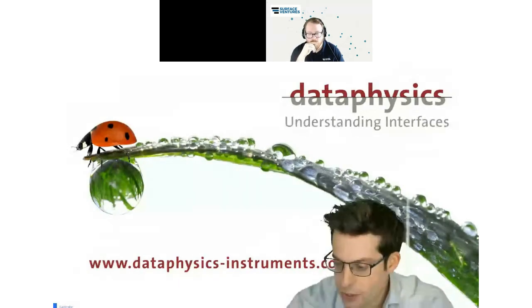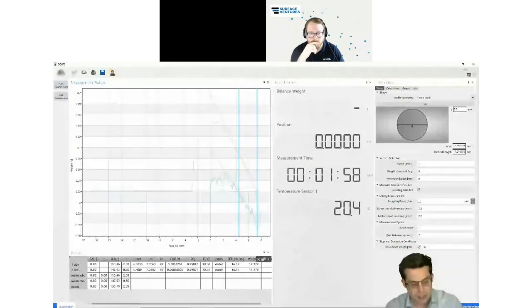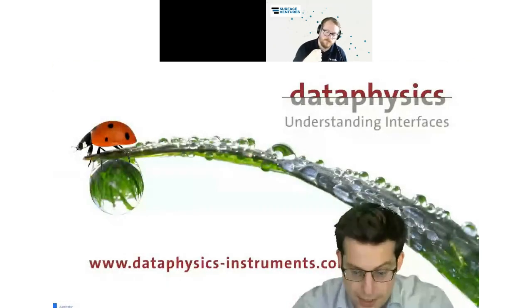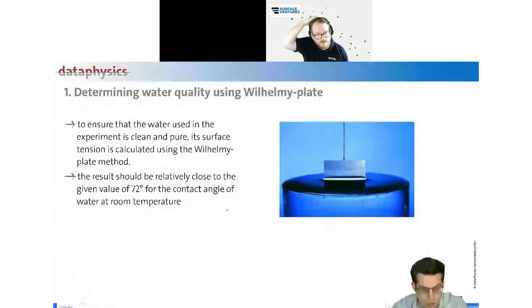For the live measurement, I want to show you again, you are getting this kind of curves, and then you are analyzing them automatically by defining some trigger lines, and then you get the slope in between. Then the system is extrapolating these linear lines until they are intersecting with the y-axis. From this value, we are then getting the mass. And then internally, the system is calculating how high the imaginary contact angles are. Okay. Now, let me quickly get to some slides where I present you these results. Probably I have now also skipped a couple of them.